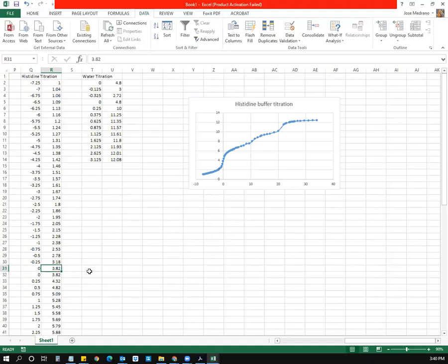3.80, and this one was, well, I'll just do like 3.81. And then for my basic titrant, this was like 3.84. And they might not even go in order. This one might be like 3.92, and this one over here might be 3.84.